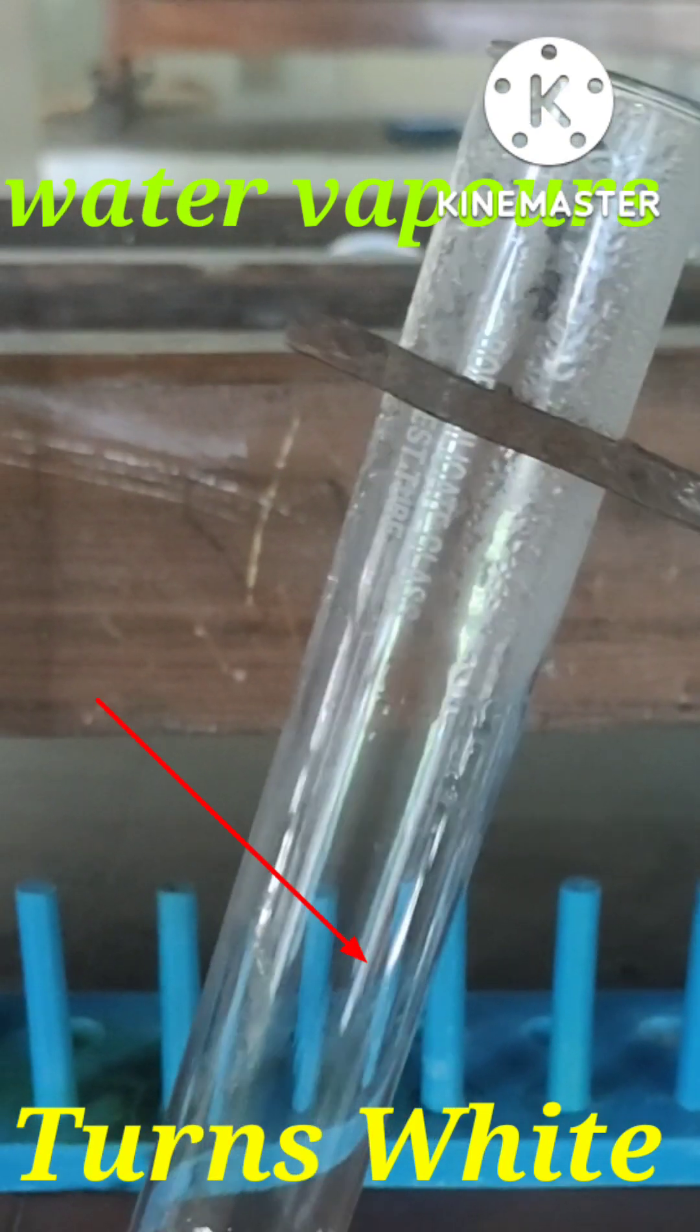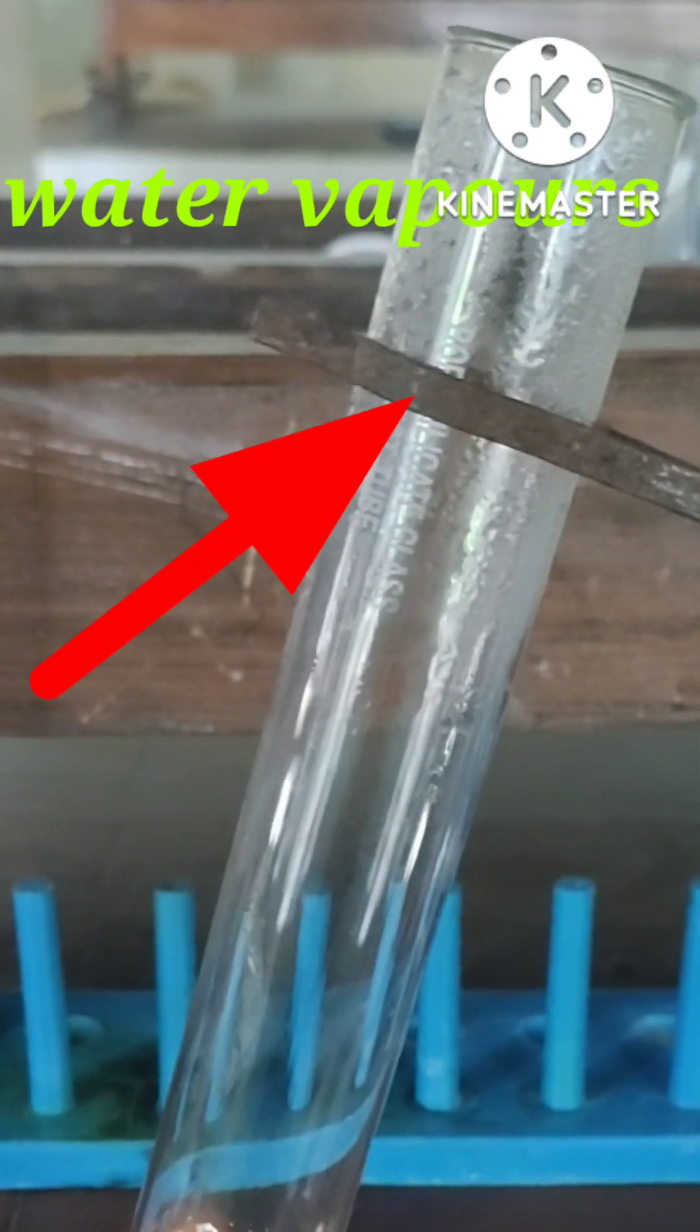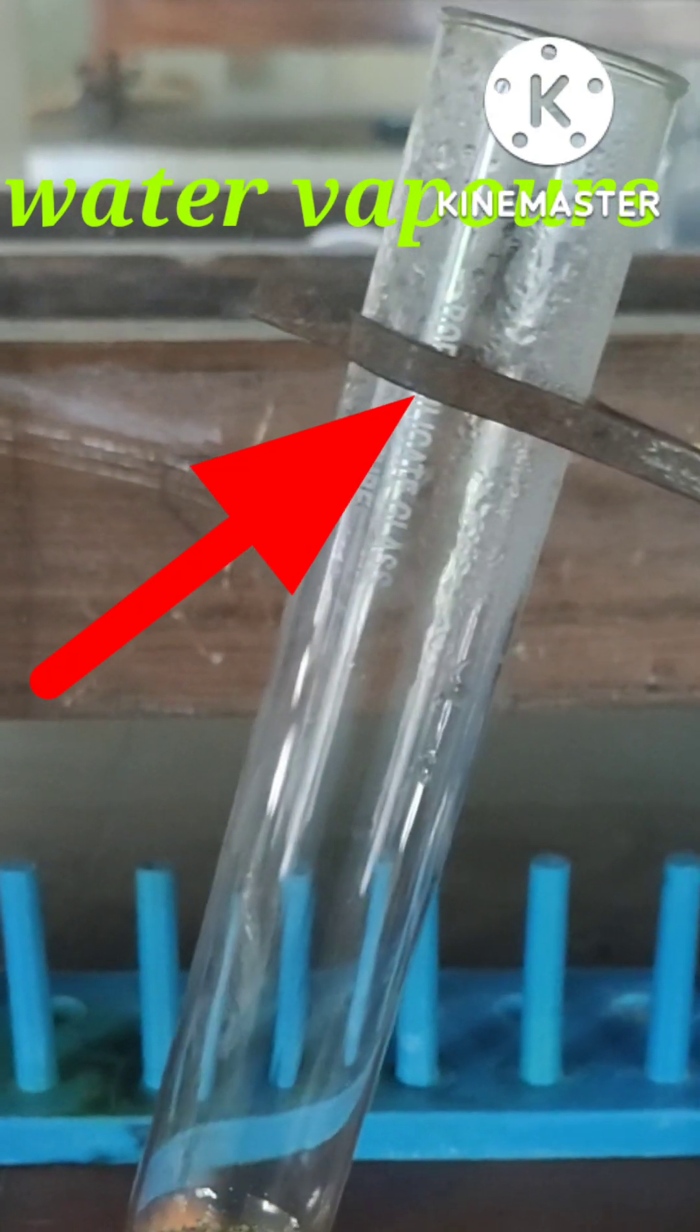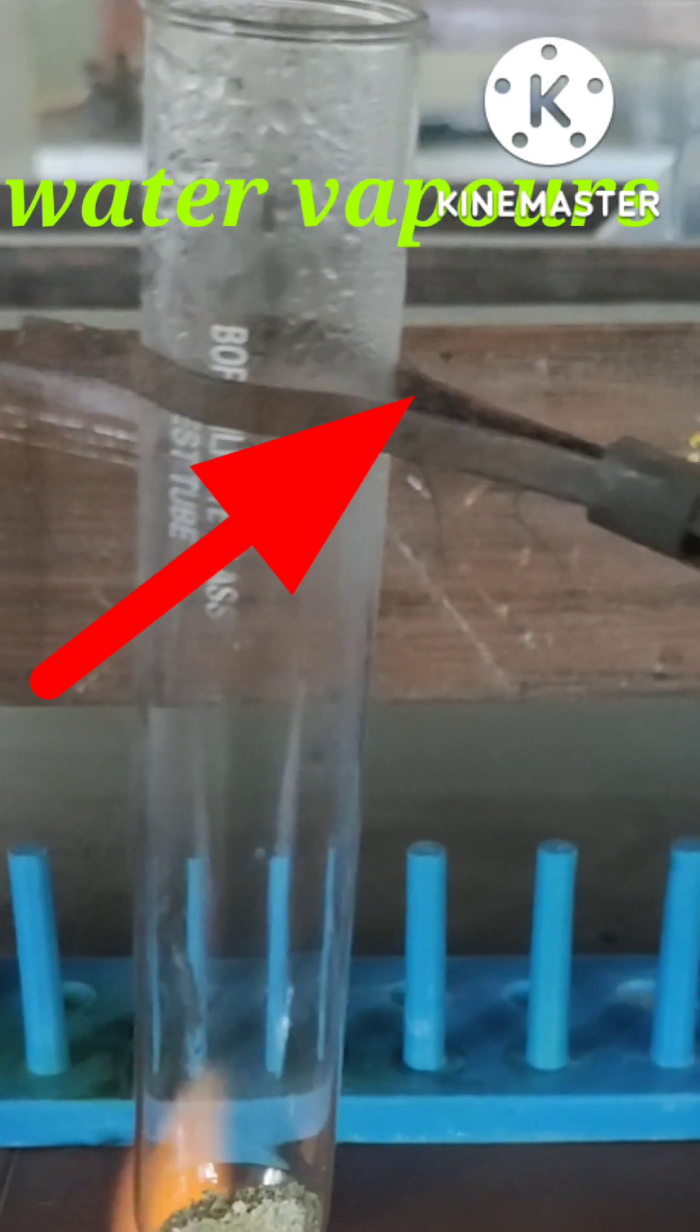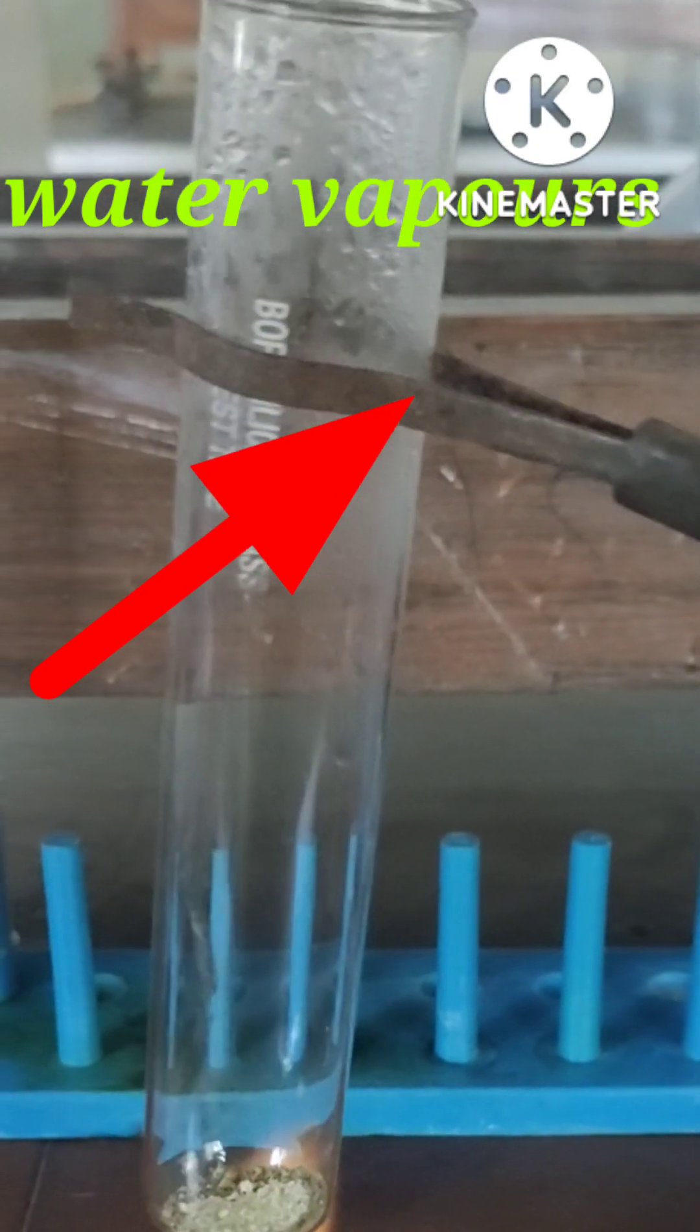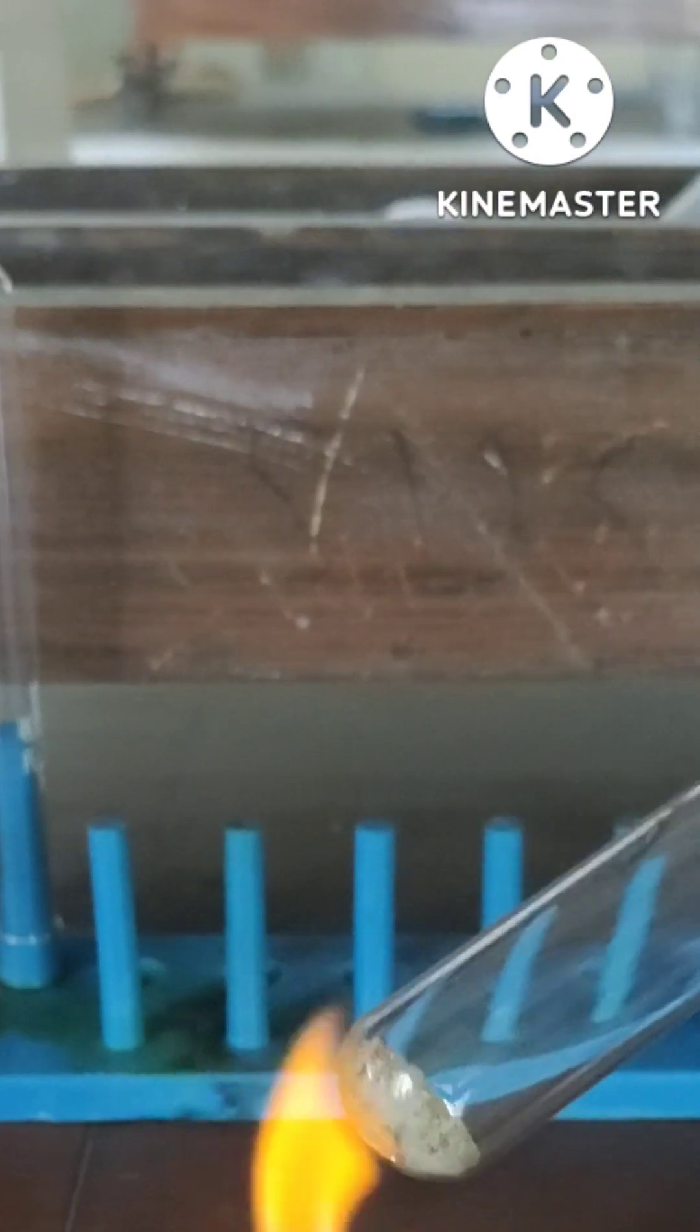Also, the color changes from green to white. Some water vapors are also seen, as the ferrous sulfate contains 7H2O in its formula.